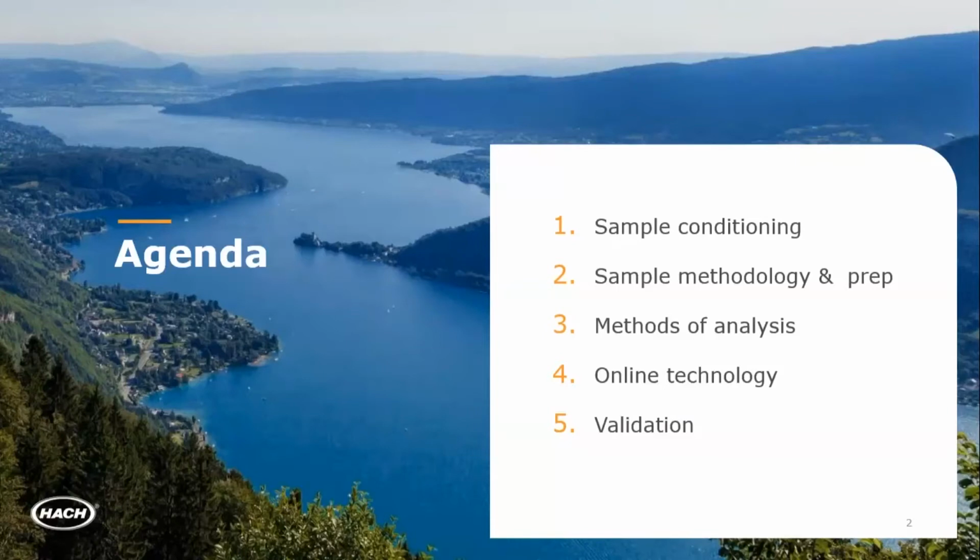As Barry suggested, grab sampling is not the ideal method. We really want to do something more online and continuous. However, since a lot of facilities are still doing grab sample, we want to make sure that if that's the only method available, it is at least being done properly. Because if you're not doing it right, there's little sense in doing it because you can be getting a lot of false information.